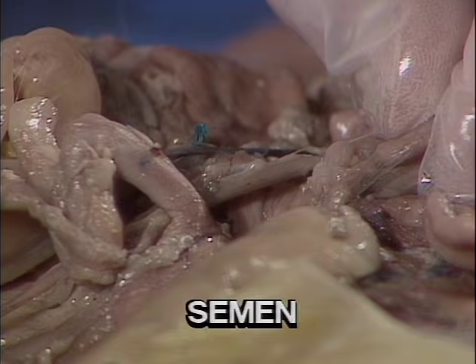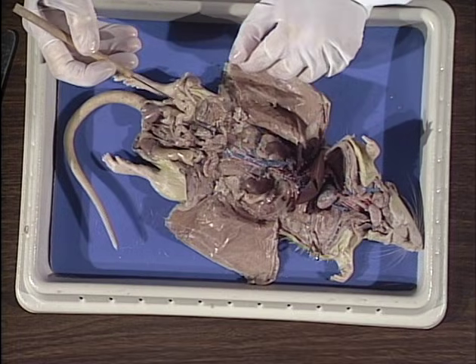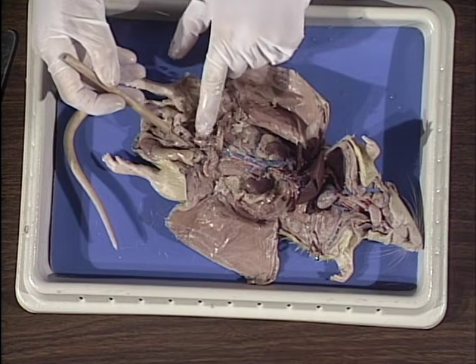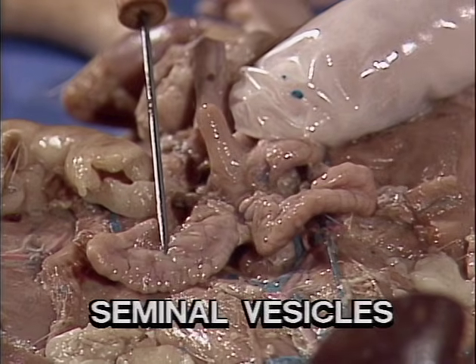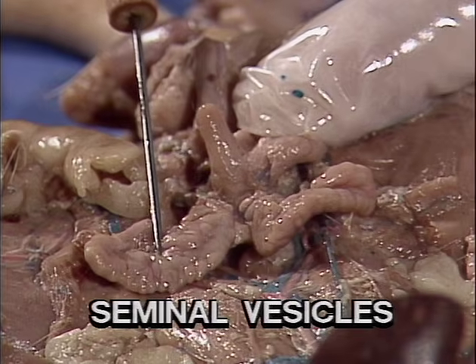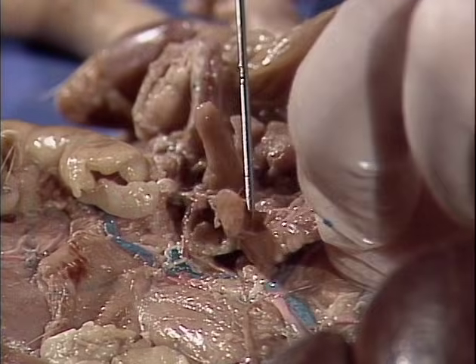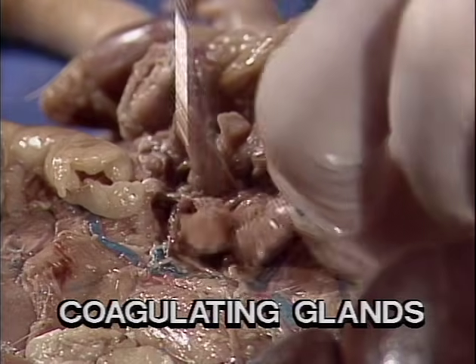Several glands open into the male genital tract. These glands produce the correct semen conditions for viable sperm. The largest glands are seen here, lateral to the bladder. They are called the seminal vesicles. They are rather rough-looking structures. On the curved inside surface, we see another gland adhering to it, known as the coagulating glands.